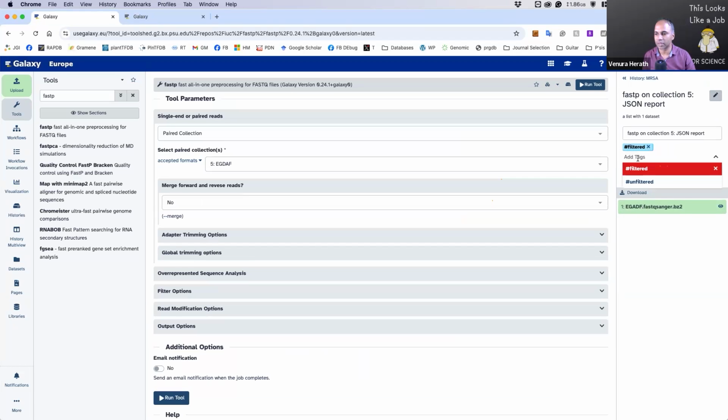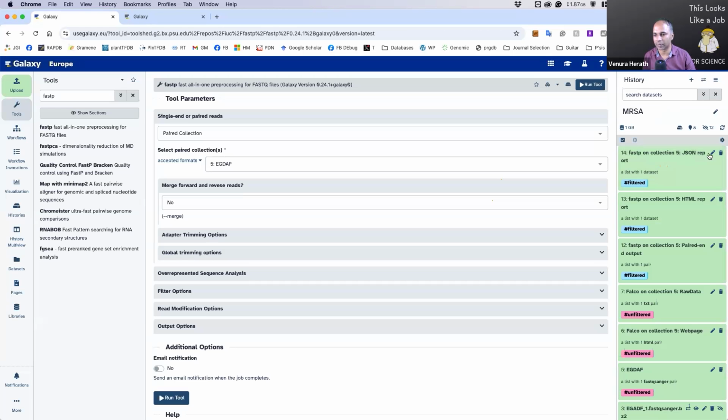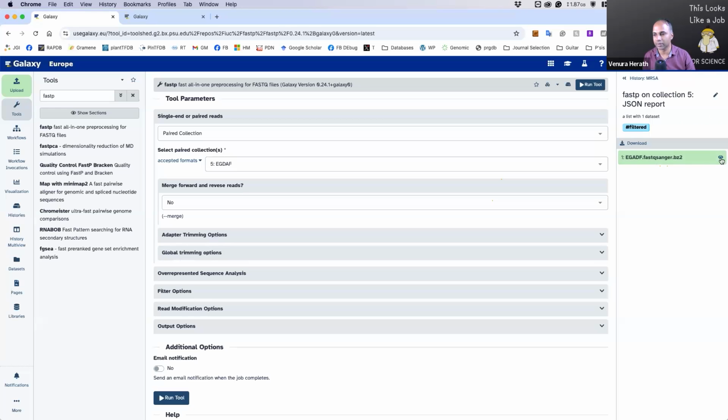Since the filter tag is already created, you can select it. Right now I already selected it, so I have only the removal option rather than the adding option. So let me remove it, and then I can add it. Then you click outside, and then you click save.